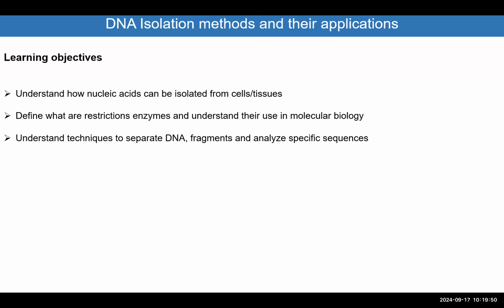So when you get to a lab and you want to perform an experiment on proteins, you have to isolate the proteins or the DNA or the RNA. You have to have the basic knowledge of how to handle the DNA and the RNA. Do these samples have to be on ice all the time? When do I put them in -20? When do I put them in -80? What are the materials that I'm using? Is there any material used during the extraction process that is risky to use? Safety measures must be taken into account.